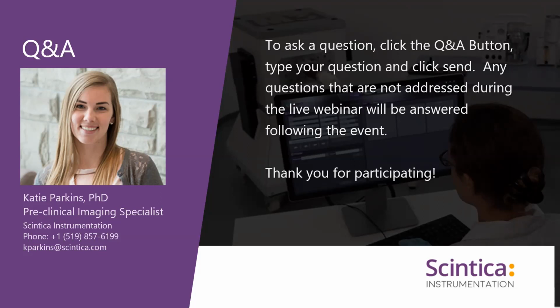Perfect, excellent. And so we talked there about multimodal imaging. You had spent a bit of time talking about multiplexed imaging. I hear people use them almost interchangeably. Are you able to clearly define the difference between the two?